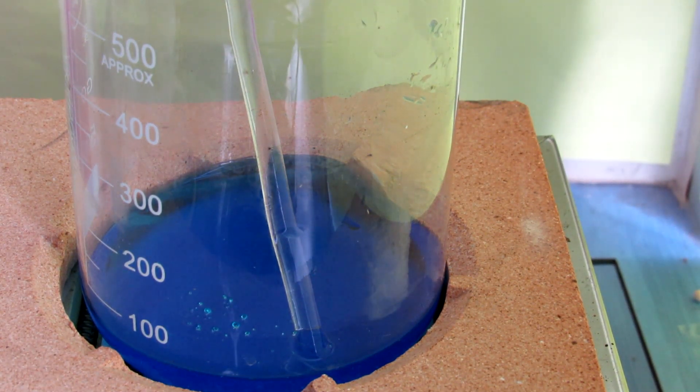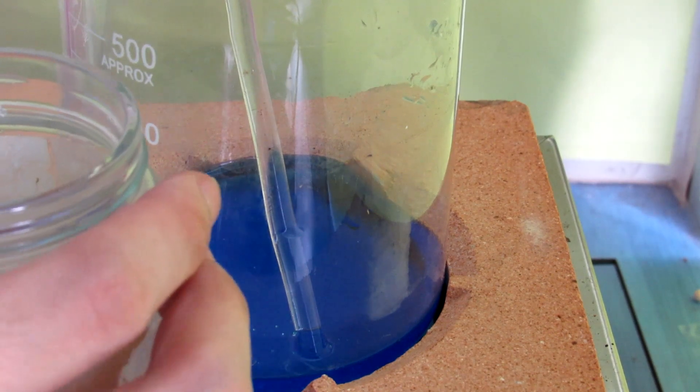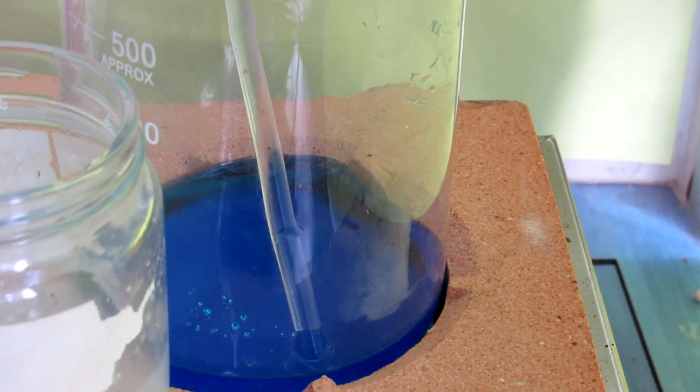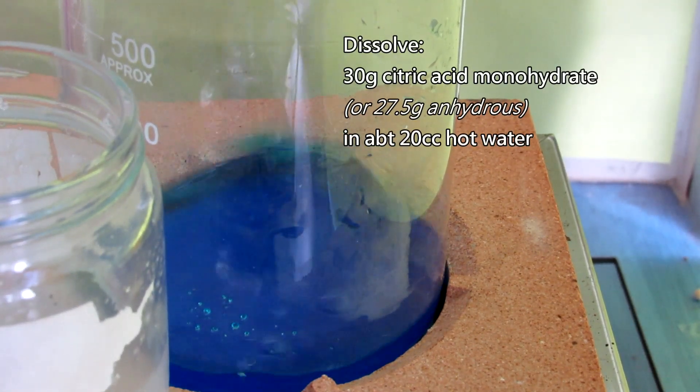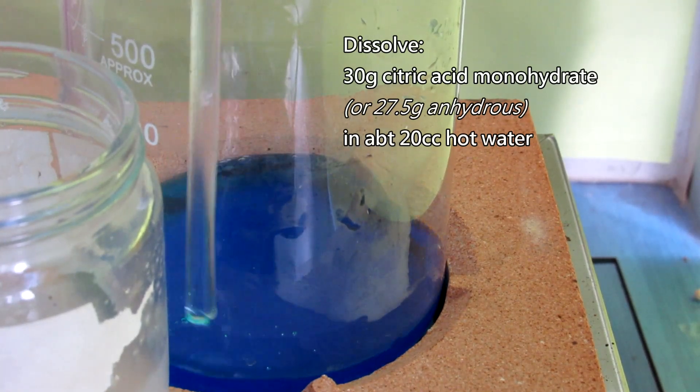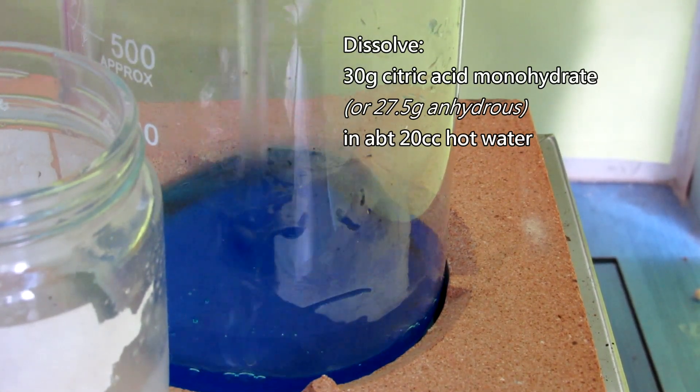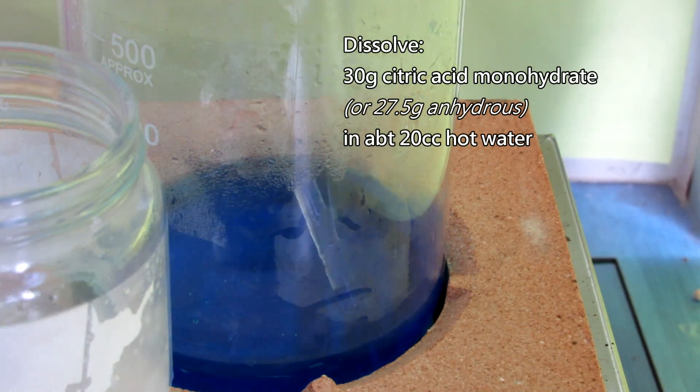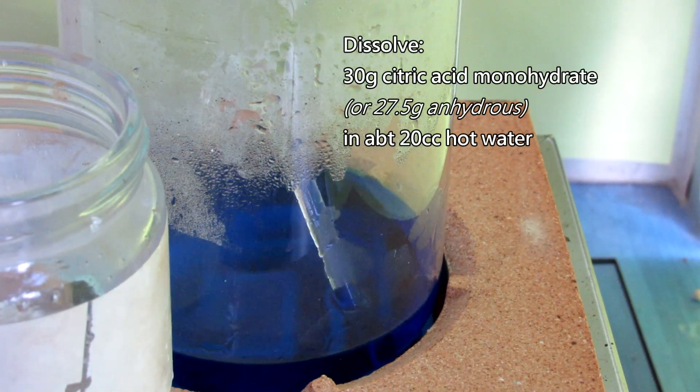While waiting for it to dissolve, I prepared some citric acid solution in another beaker. This was done by dissolving 30 grams of citric acid monohydrate in about 20 cc of water. I also heated the solution on the same heater to speed things up.